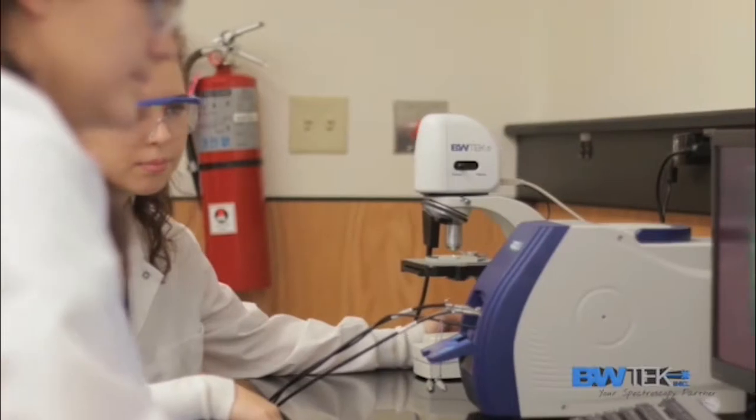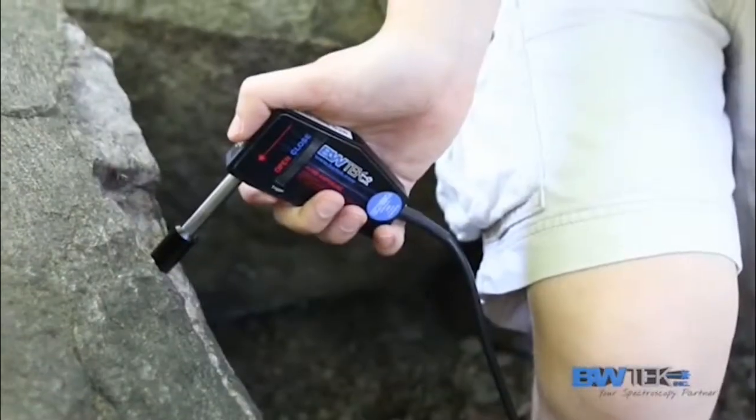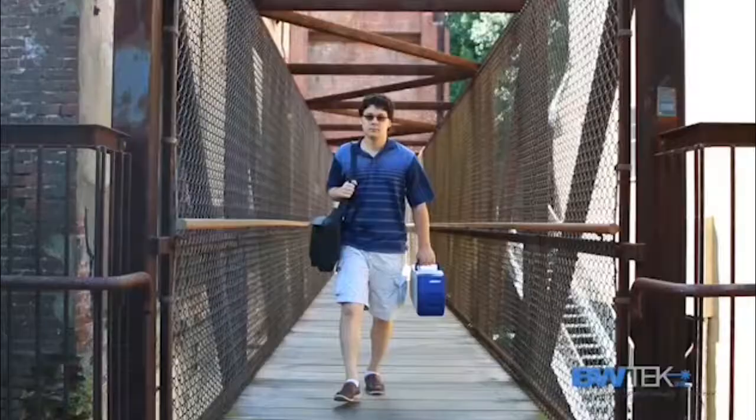Our iRamen instruments' lightweight design and low power consumption allows users the flexibility of taking measurements both inside and outside the lab. Its convenient carrying handle makes it easy to transport out into the field.